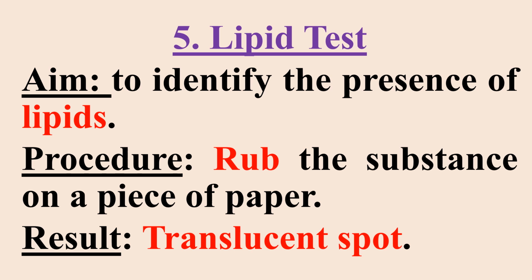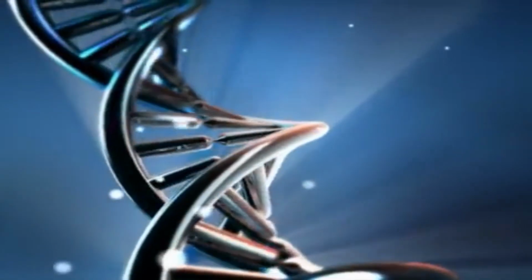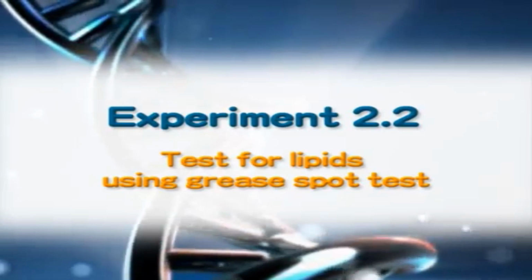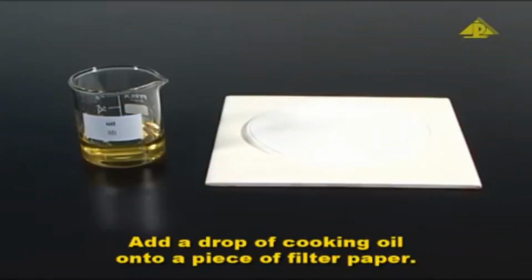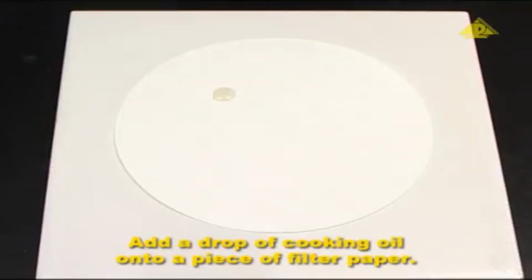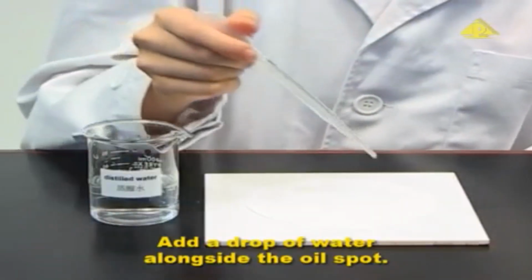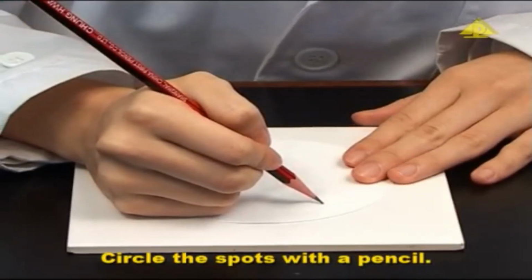Okay, so it identifies the presence of lipids. Add a drop of cooking oil onto a piece of filter paper. Add a drop of water alongside the oil spot. Circle the spots with a pencil.